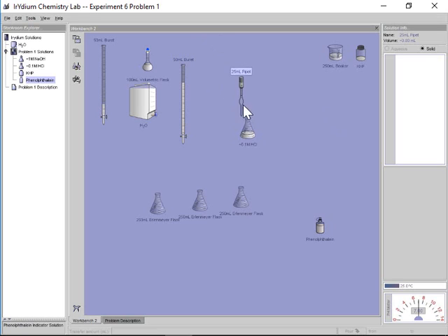Just to show you with the 25 how that looks. Take the 25. Again, this one acts like a straw. I'm going to transfer an amount here. I'm going to withdraw 25 milliliters, suck up 25. This would be calibrated for 2 decimal places, 25.00. I'm going to transfer that into the Erlenmeyer flask here. I'm going to pour the whole 25, and that's going to be 25.